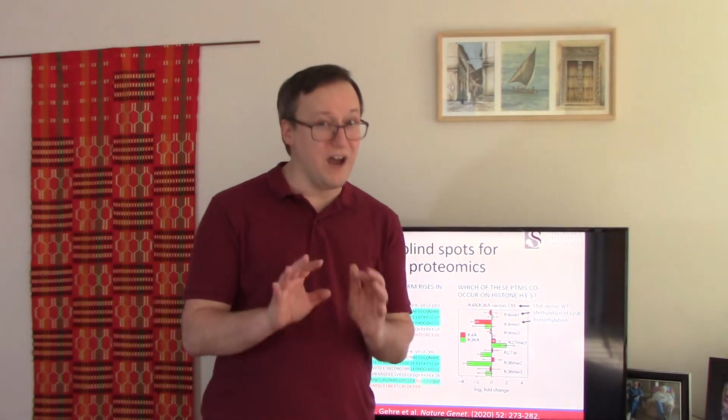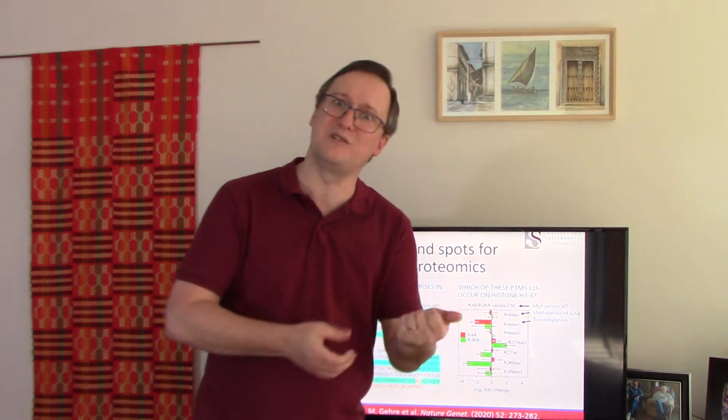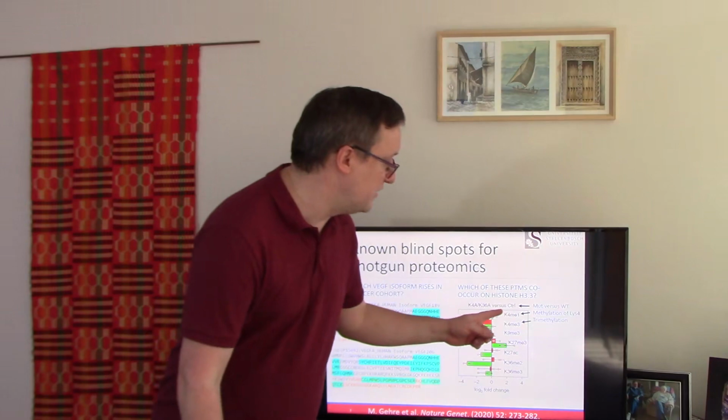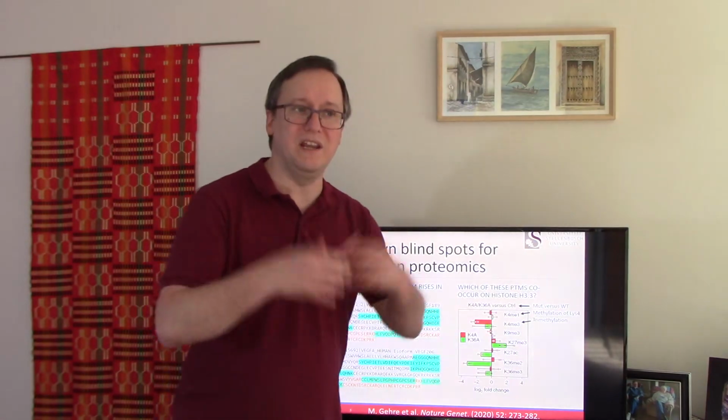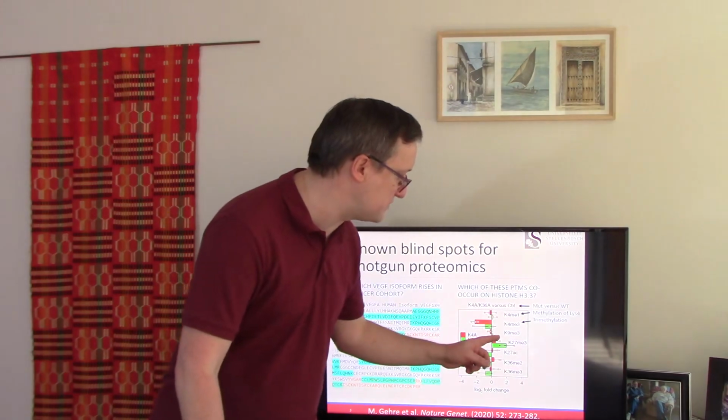Now, it should be very obvious that lysine 4 having two different PTM states here is already in a case where independence cannot be claimed. If this residue bears methyl 1, bears a single methylation, it does not also bear a triple methylation. It's one or the other, or it's just unmethylated altogether. So these two cannot coexist, and therefore they're not independent PTMs.